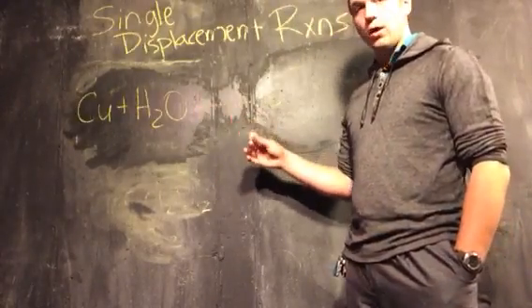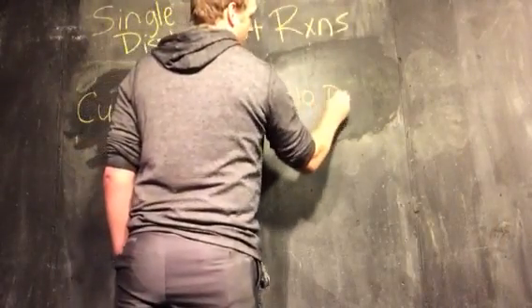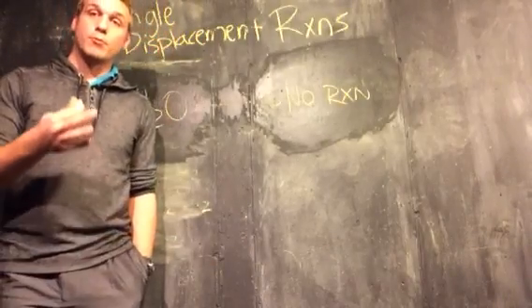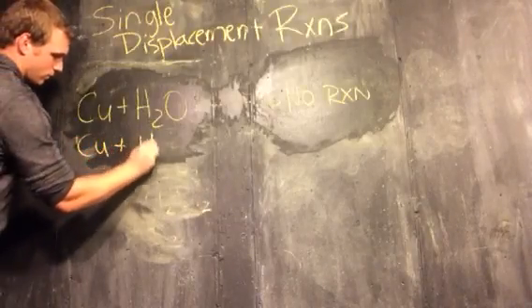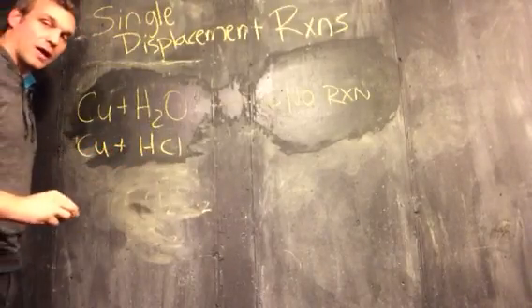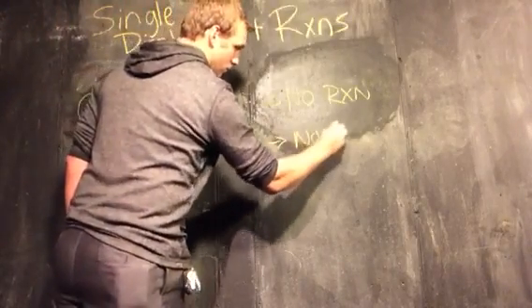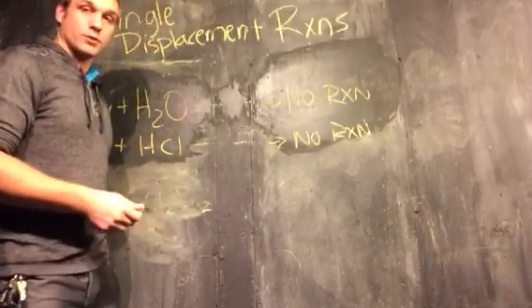So copper plus water gives you no reaction. Copper plus acid, that's hydrochloric acid, also gives you no reaction.